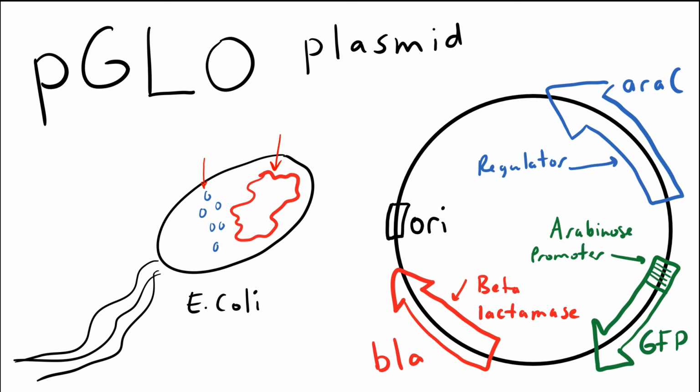So as you might recall from lessons on DNA replication, basically DNA replication starts at an origin of replication, and so that's what we have here. This ensures that the bacteria plasmid is copied into each clone during binary fission as the bacteria multiply, so you get copy after copy after copy of the plasmid in DNA for further expression.